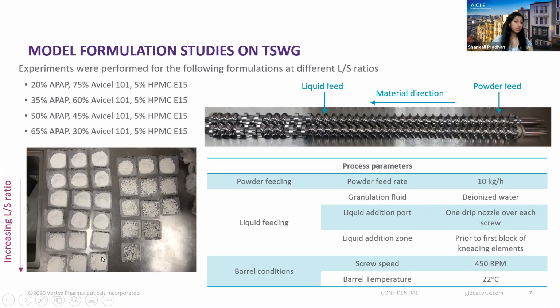This is how our granulation looks at different liquid to solid ratios. We go all the way from dry, free-flowing powder, all the way until clumps and finally paste.